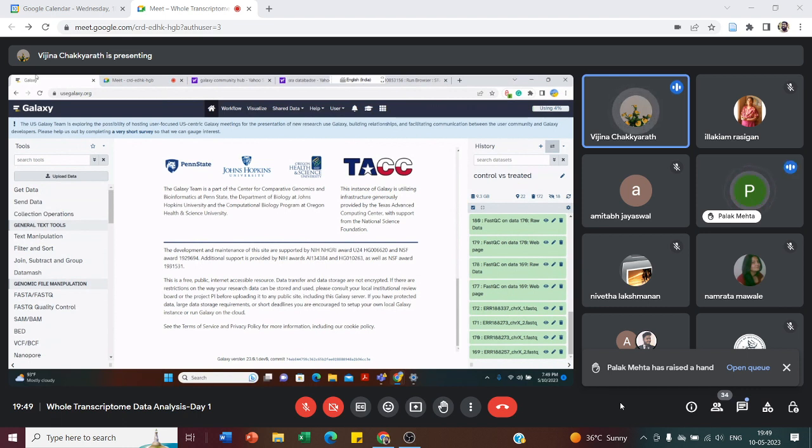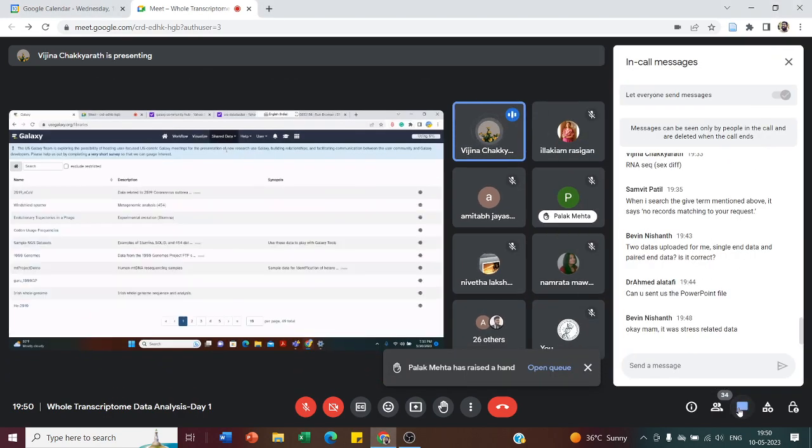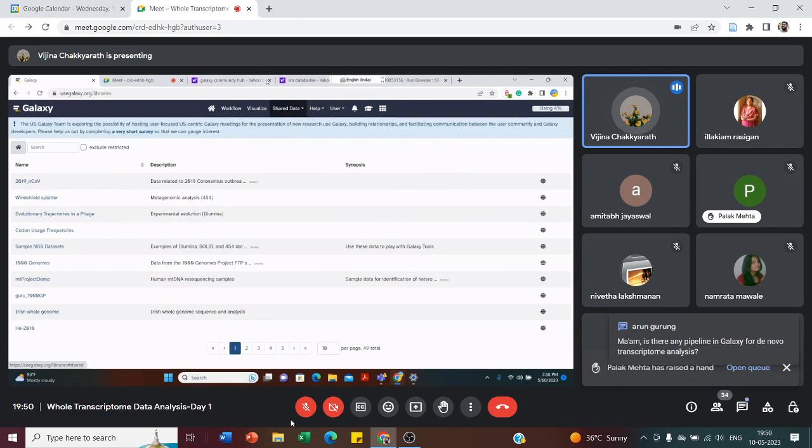Okay, so the main thing is that you just download that particular data that I mentioned in the shared data, what I showed in the data libraries. You just try to download that particular data. Then we can continue that session tomorrow.